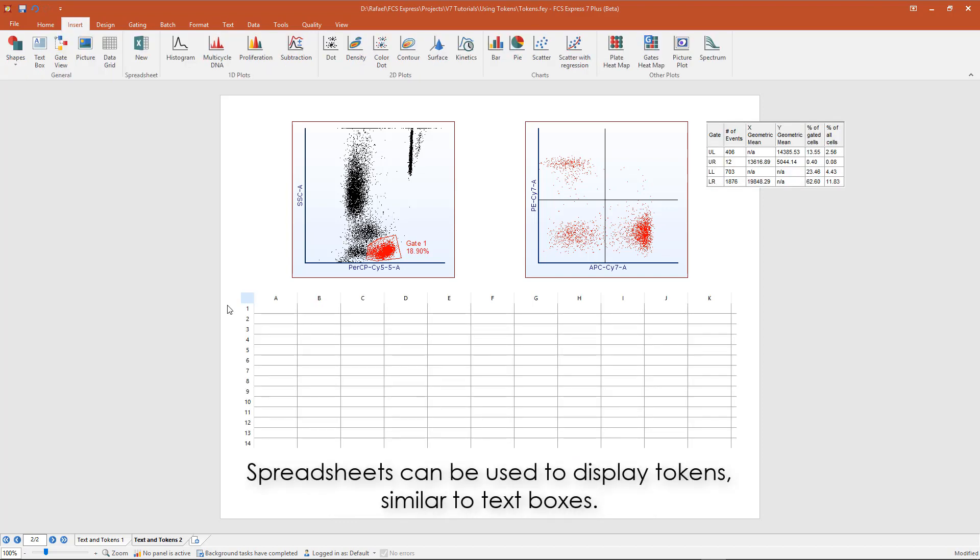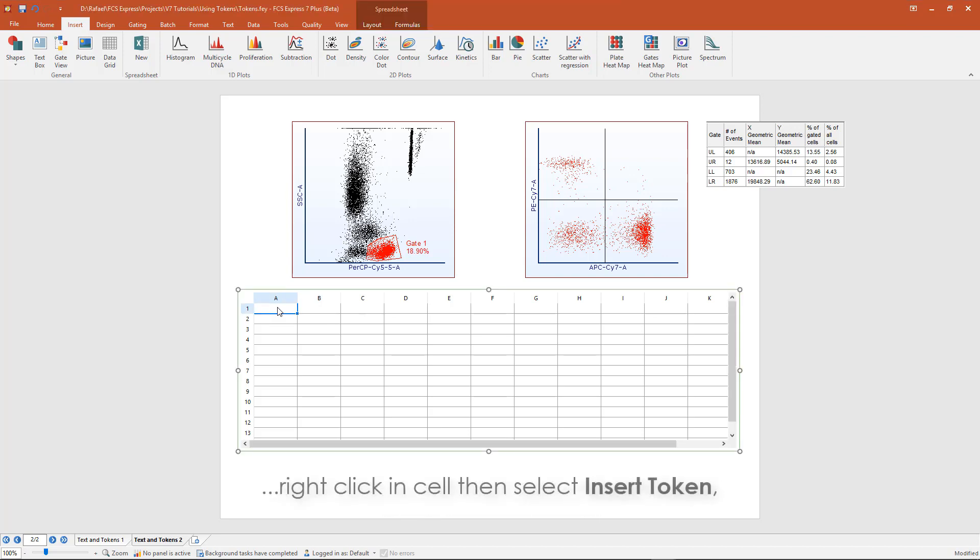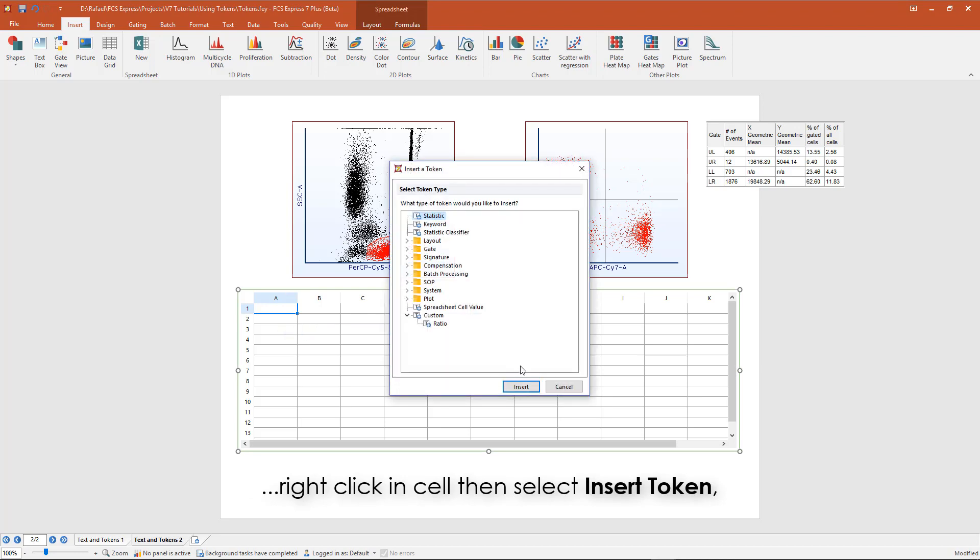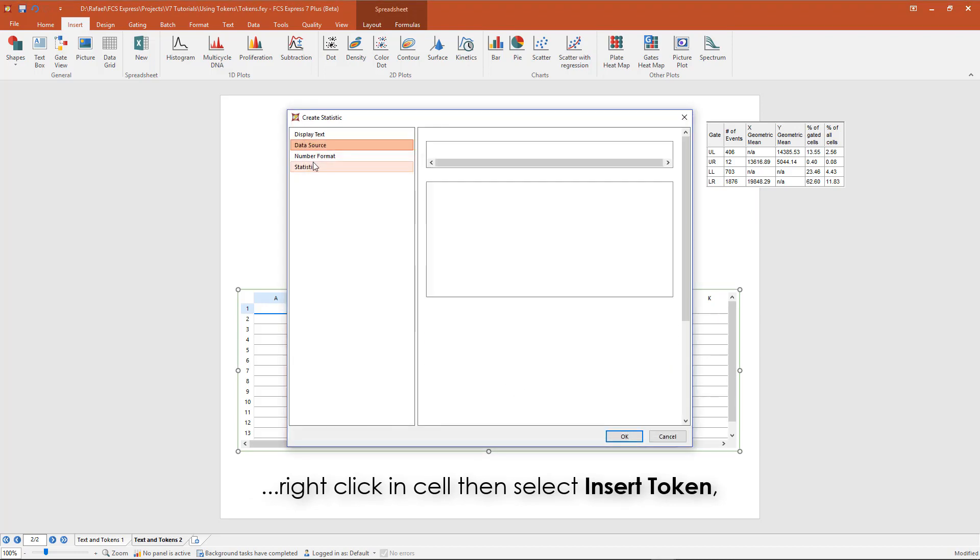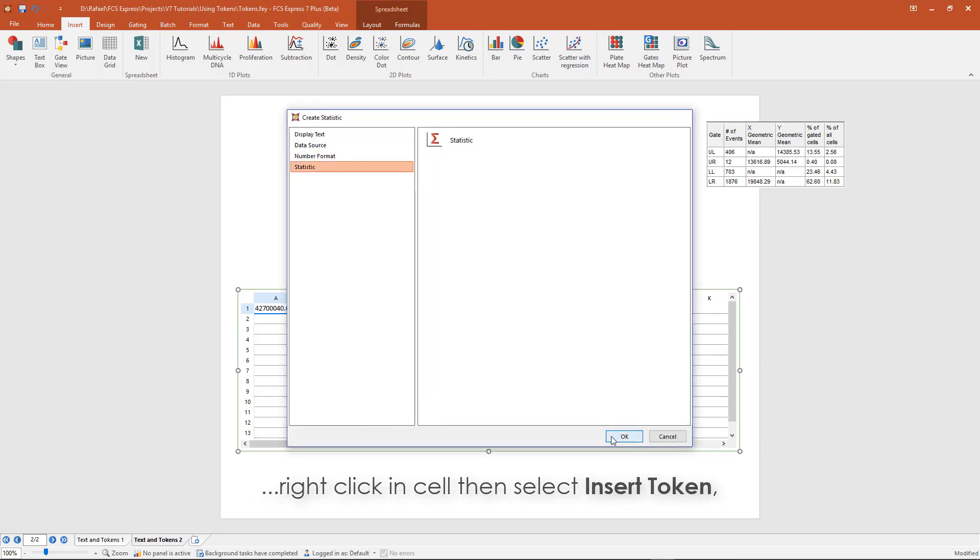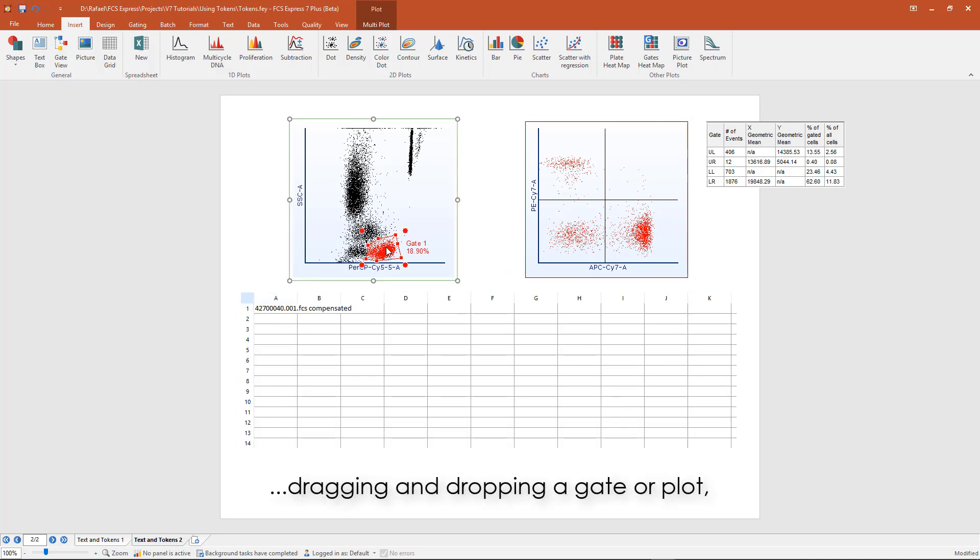Spreadsheets can be used similar to text boxes to display tokens. Tokens can be inserted into spreadsheets through a right-click in a cell, or by dragging and dropping a gate or a plot.